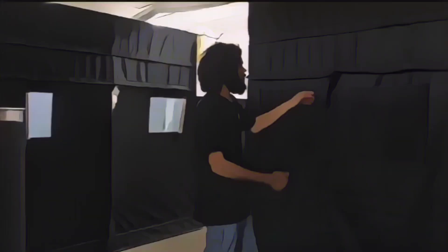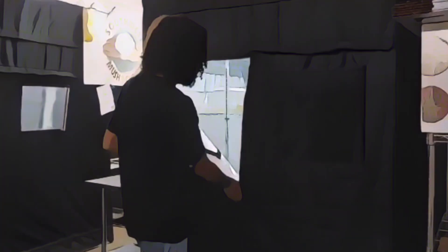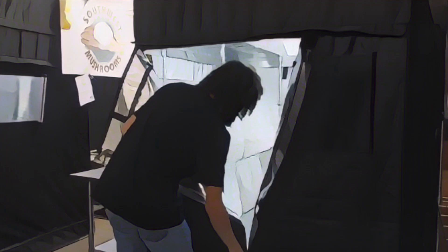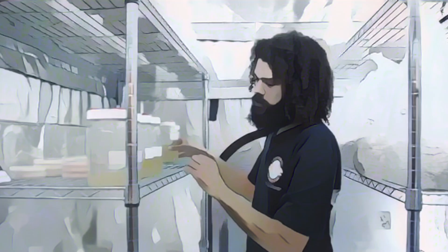I'm going to be taking a look inside my spawn incubation and culture media room. I'm going to select out some cultures for today and take a look at some of my spawn. I have some liquid cultures that I've been working on.